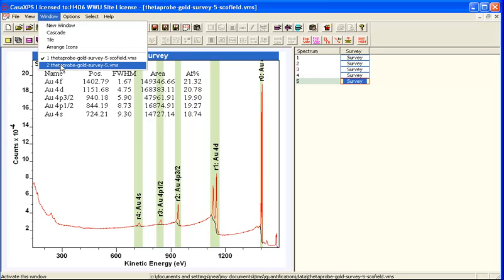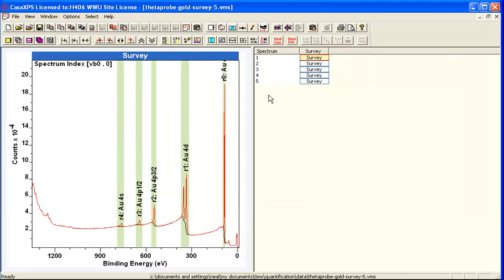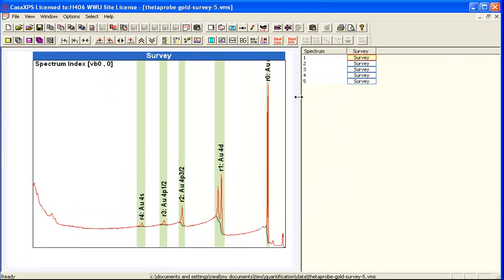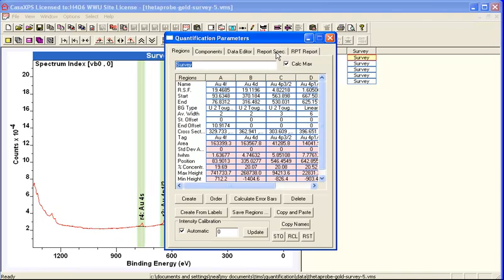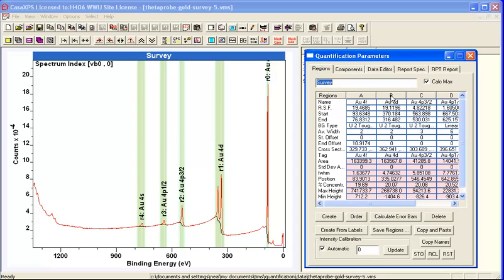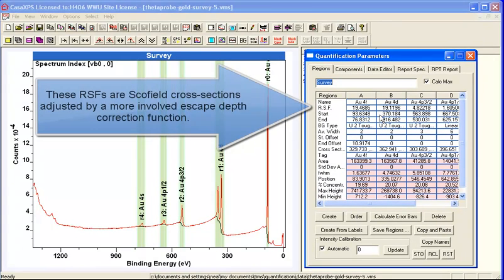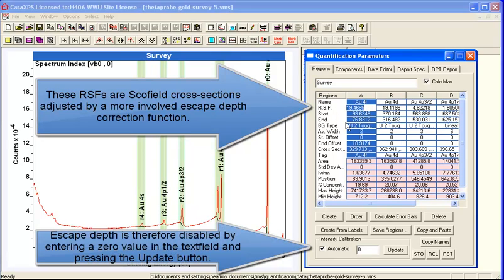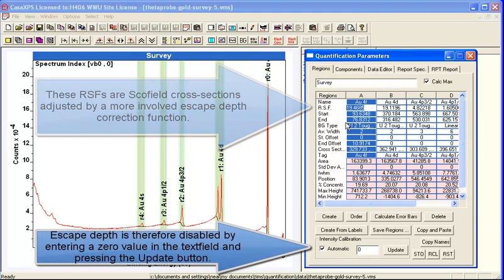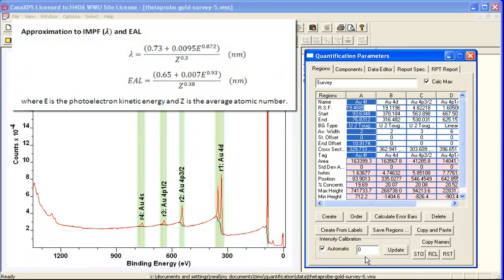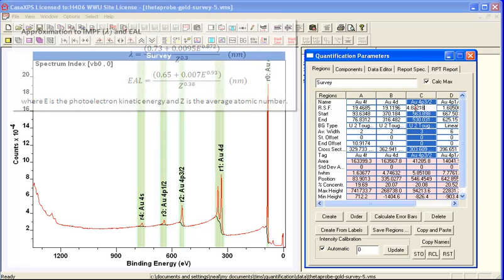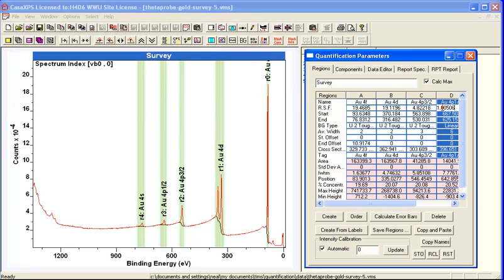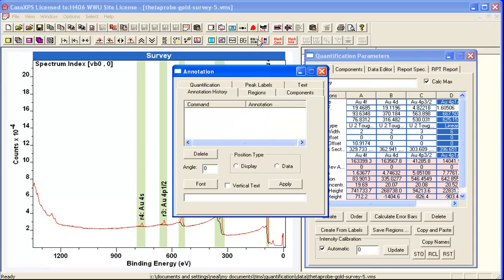There is another method for correcting data of this form and this involves using a slightly improved form of the escape depth correction that can be included in the RSFs. There's a more complex functional form than simply the kinetic energy raised to a power that has been used to calculate relative sensitivity factors that are corrected for escape depth.